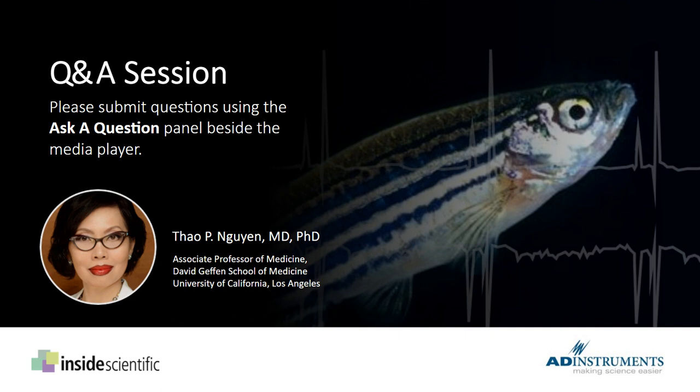If we have to predict, it is because of the differential expression of some ionic currents in the ventricular base compared to the ventricular apex that sets up these gradients. Now, what is the molecular identity? Which current is that? We are currently working on it, but we do not have the specific answer yet.